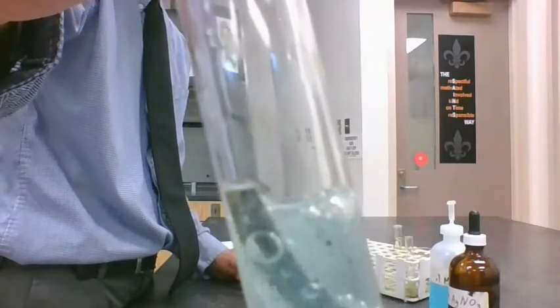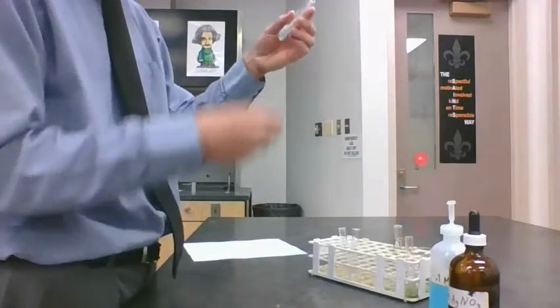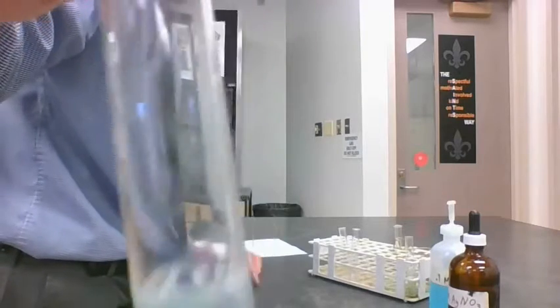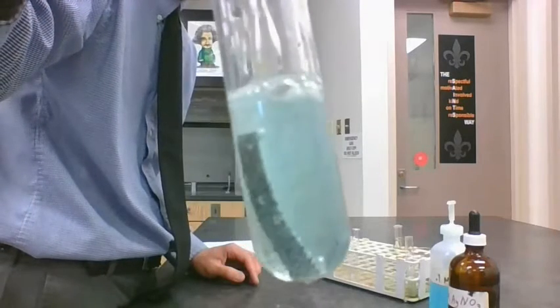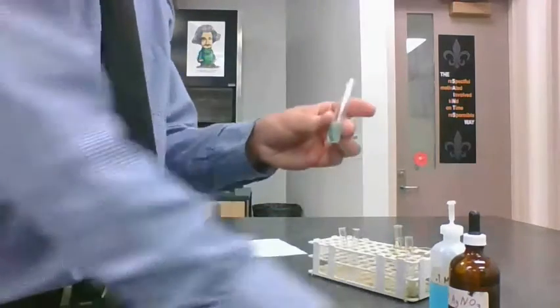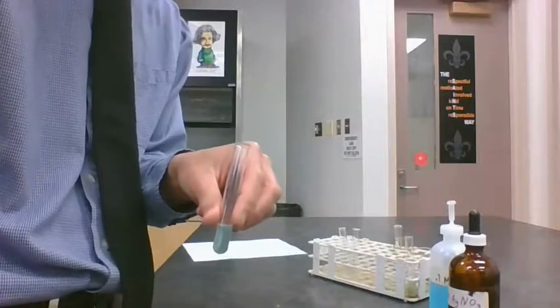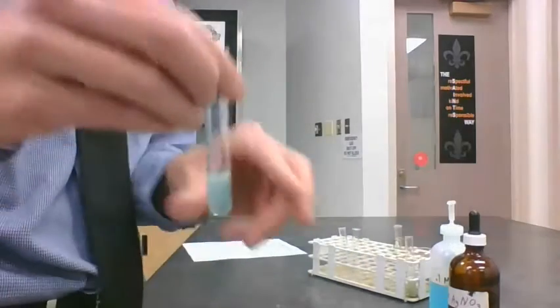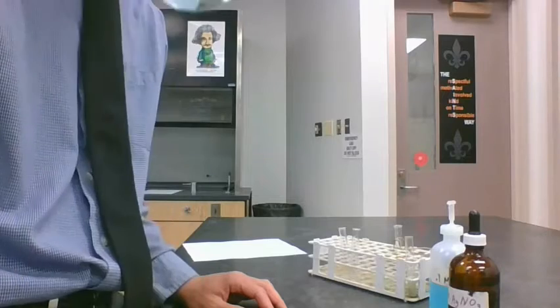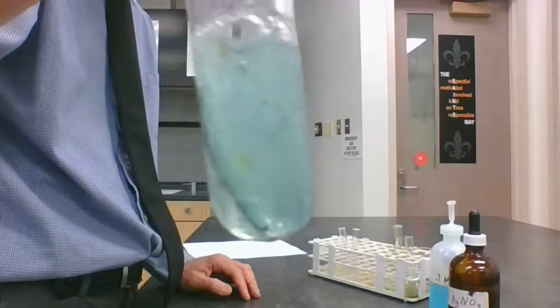It looks like there's some black pieces kind of breaking off of the magnesium. It's not that shiny color anymore. It's becoming darker, like blacker colored. And it's actually reacting pretty fast.